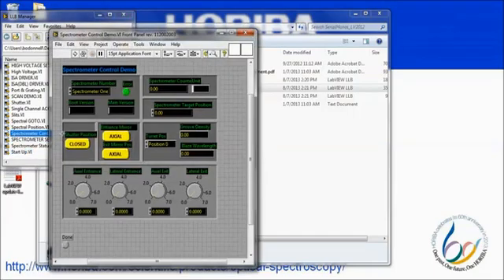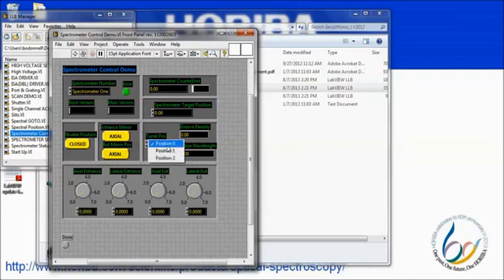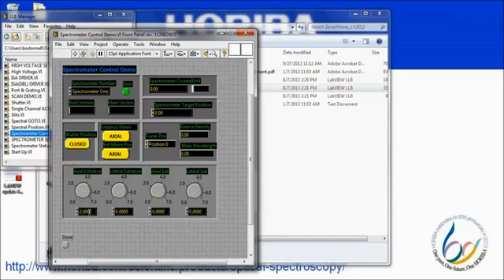Finally, the example code may be run. Here we see the same controls that were in the USB spectrometer demo. You may set the wavelength, turret position, mirror position, and slit widths using either the knob or by typing in the numerical boxes. Executing the VI will move all of the motors to their corresponding proper positions.